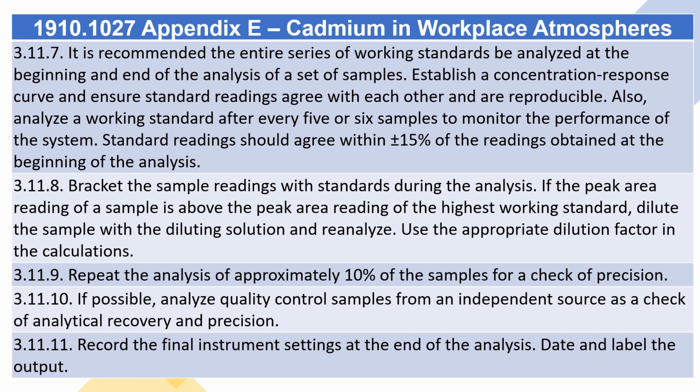3.11.8. Bracket the sample readings with standards during the analysis. If the peak area reading of a sample is above the peak area reading of the highest working standard, dilute the sample with the diluting solution and reanalyze. Use the appropriate dilution factor in the calculations.